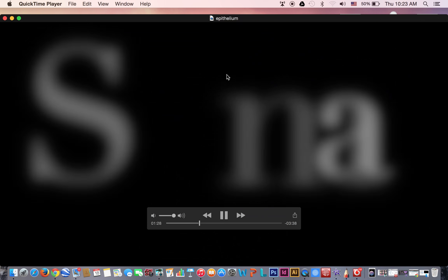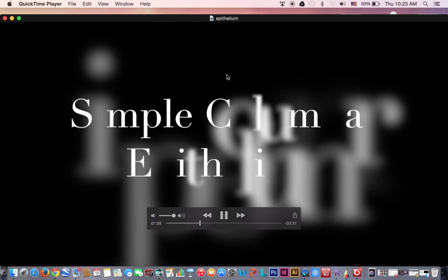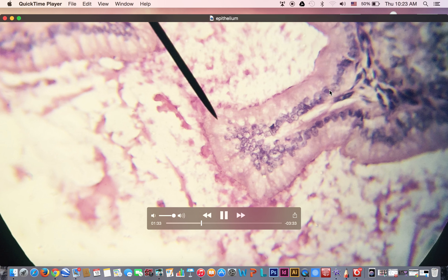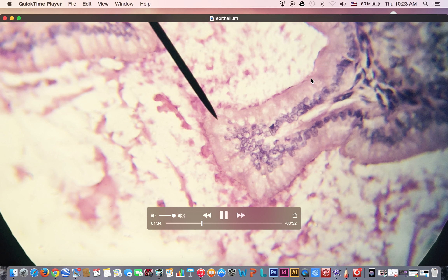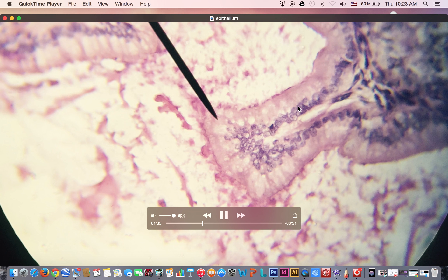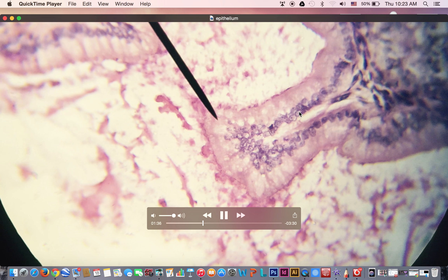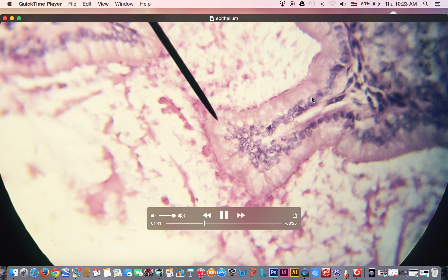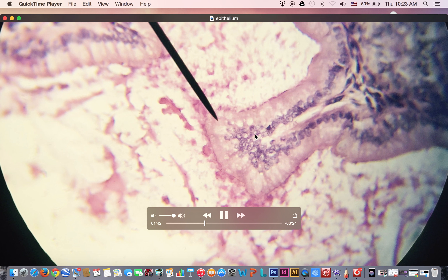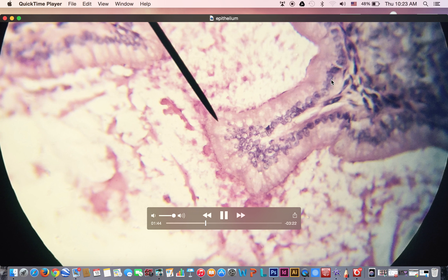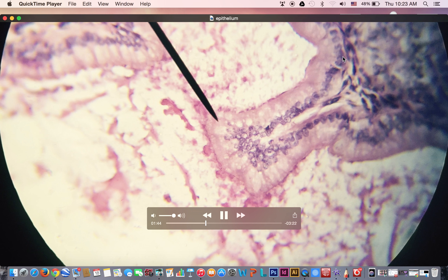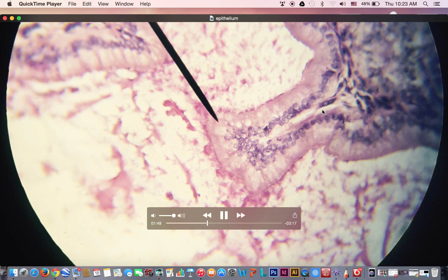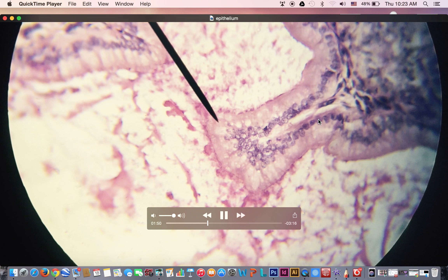This is a simple columnar epithelium — one layer of columnar cells. Although it appears to show many nuclei because the section is not taken in a thin plane, these are actually one layer of tall columnar cells. The cell is very tall, and the nucleus is present at the base and is oval in shape.